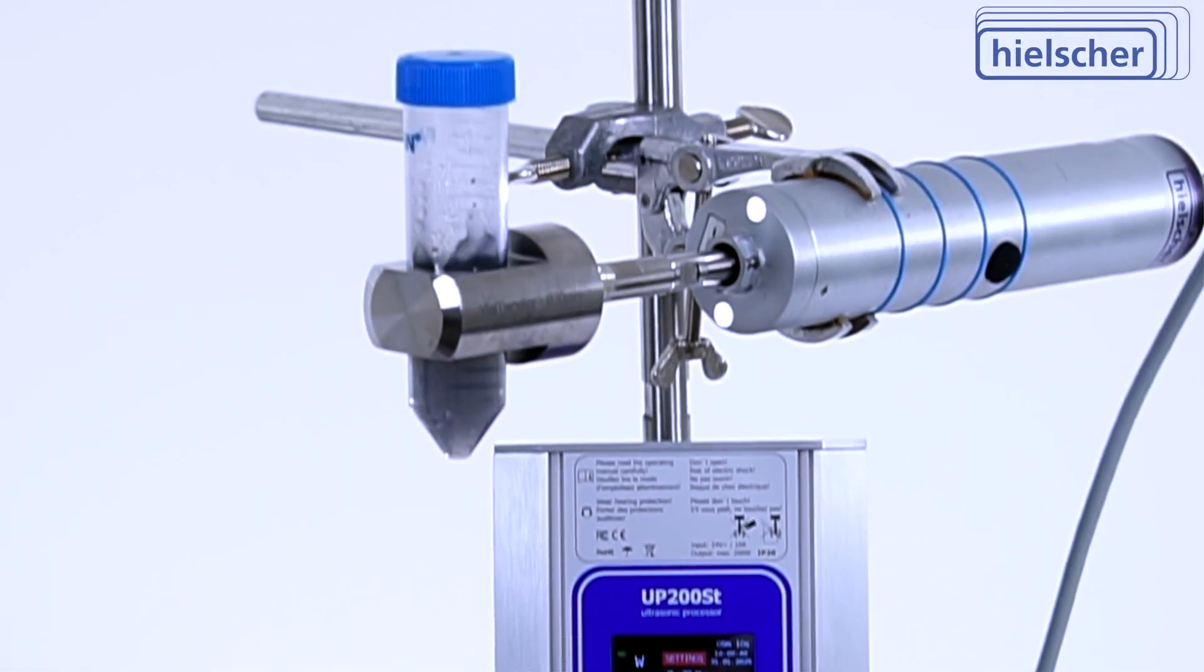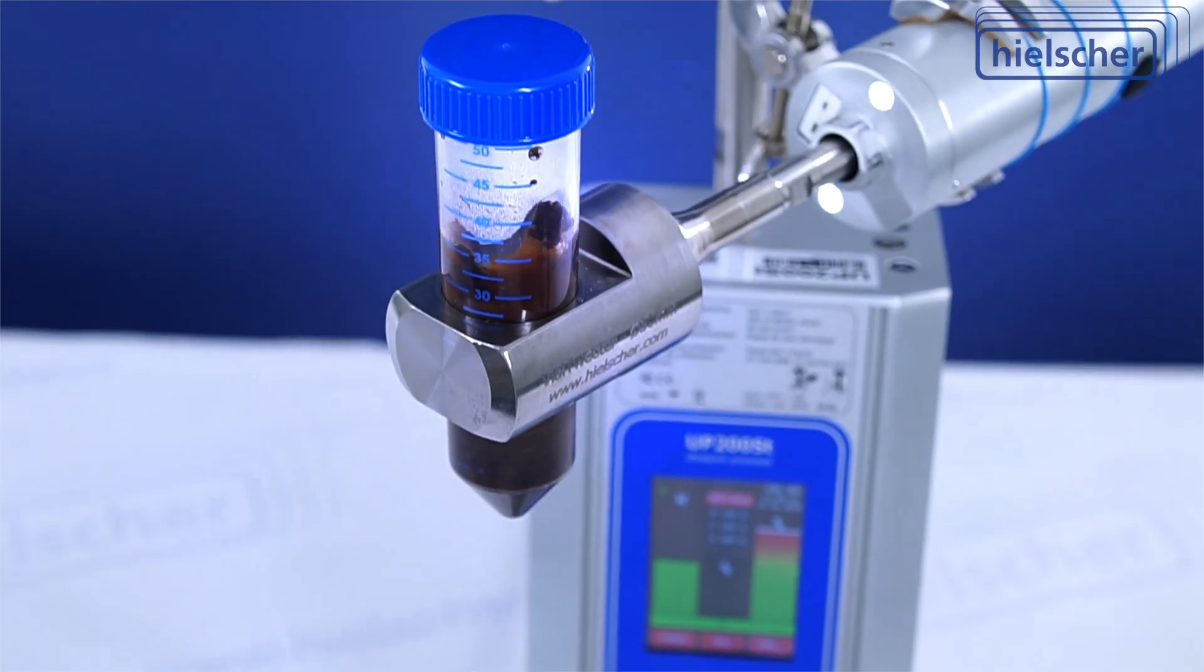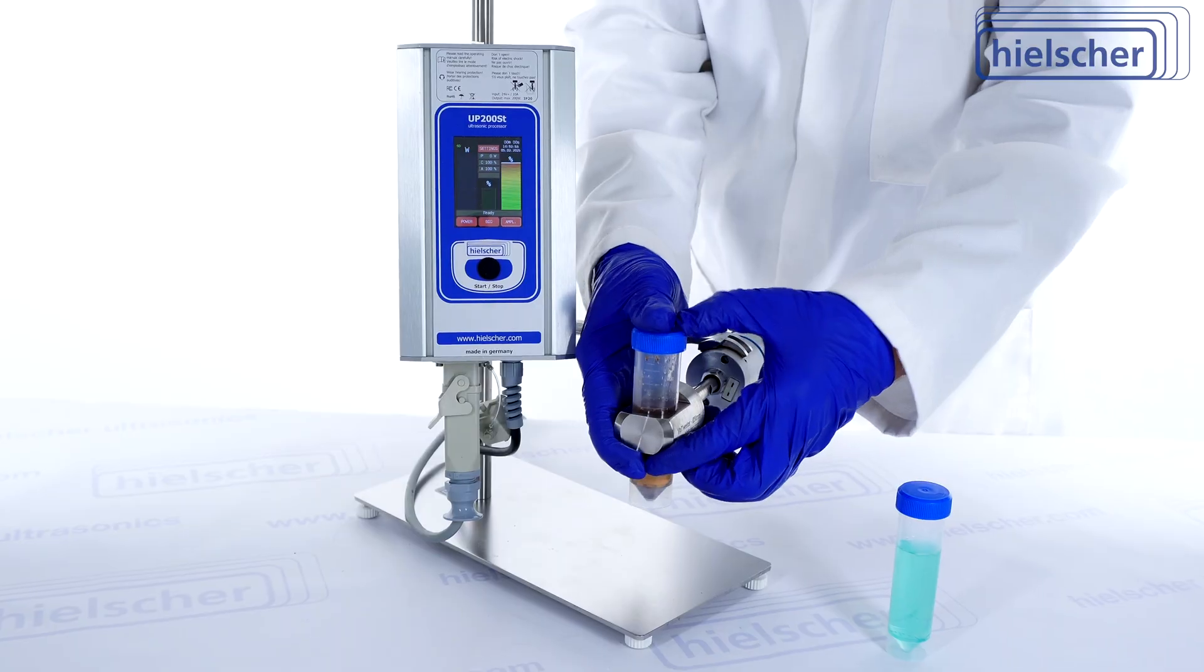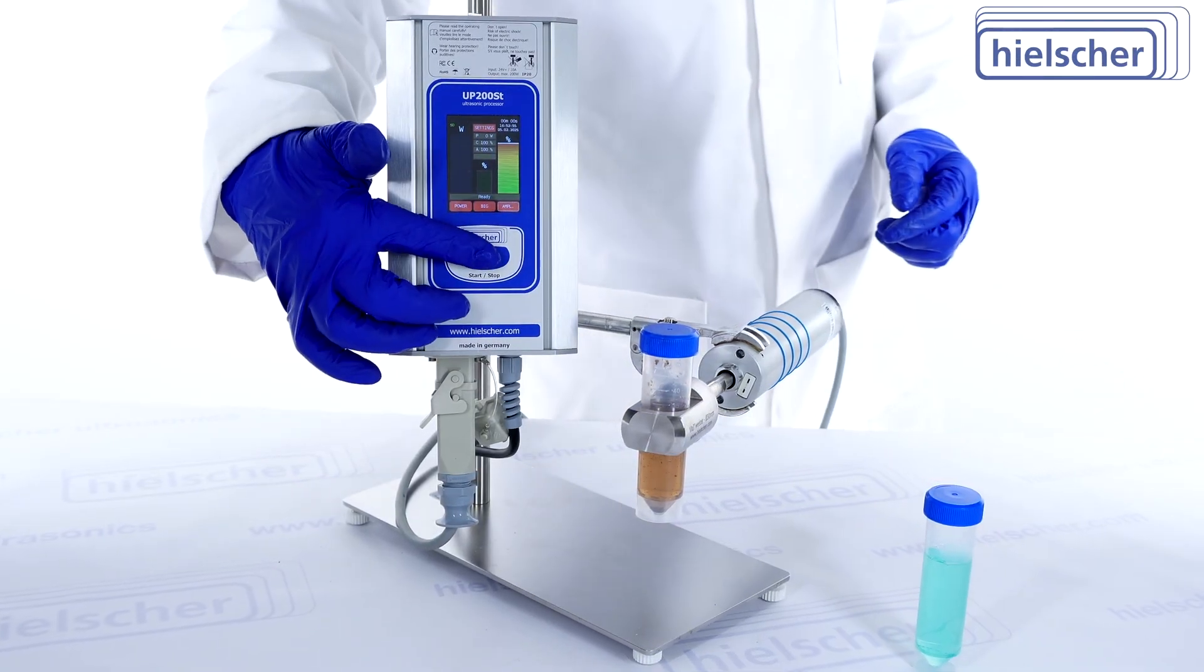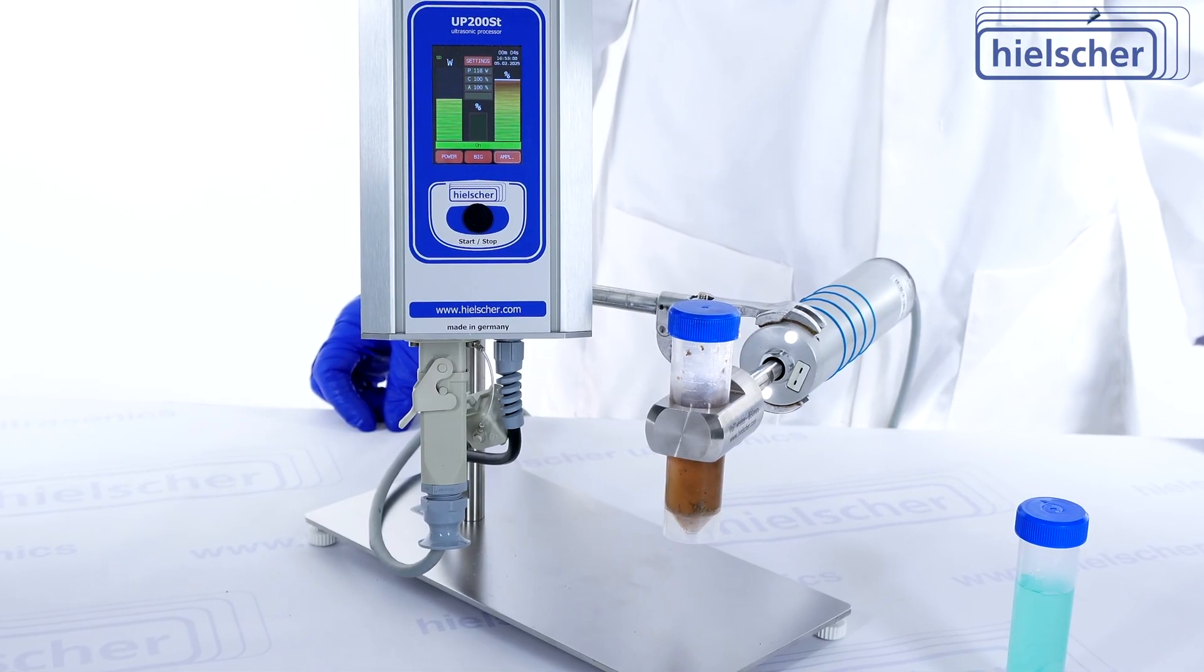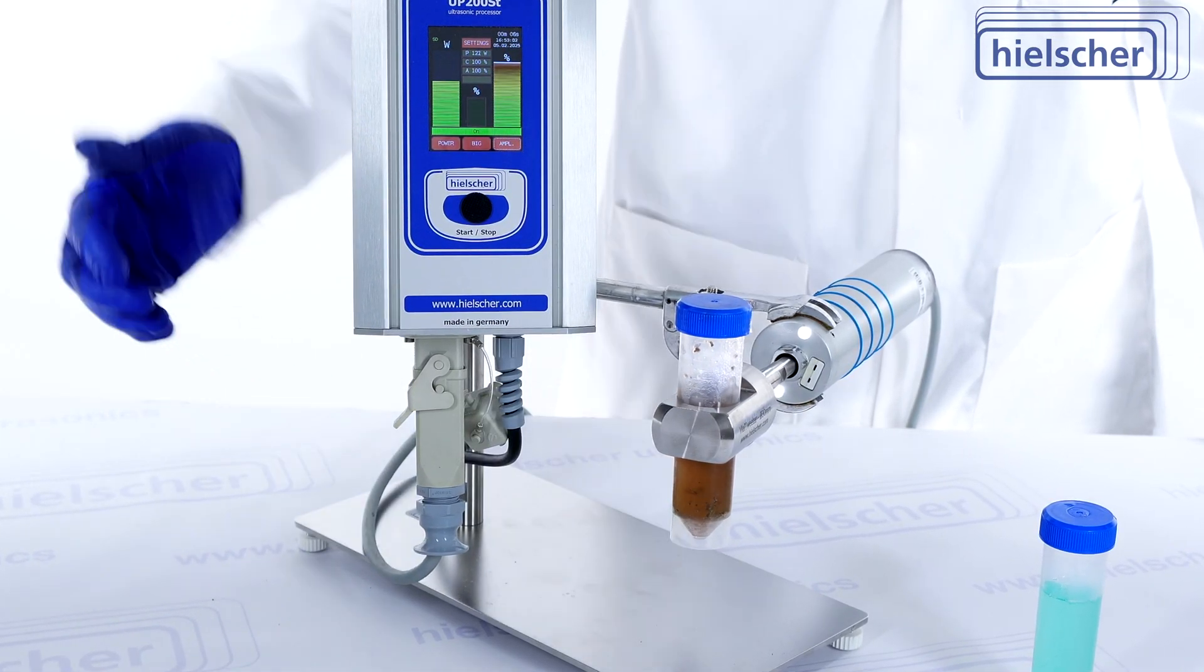High-intensity sonication opens the door to diverse research and industrial applications. For example, molecular biologists can lyse E. coli or yeast cells rapidly while minimizing contamination risks, as the closed setup maintains sterility and prevents solvent evaporation.